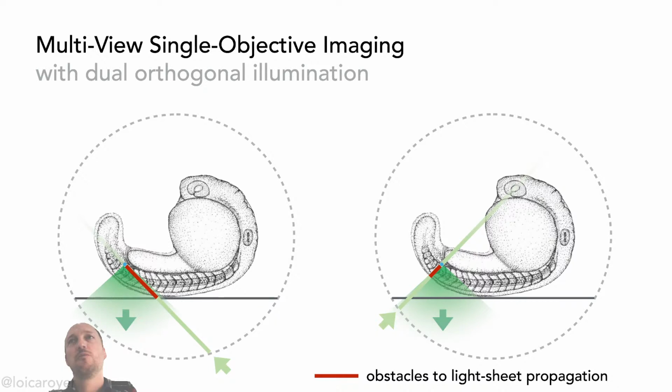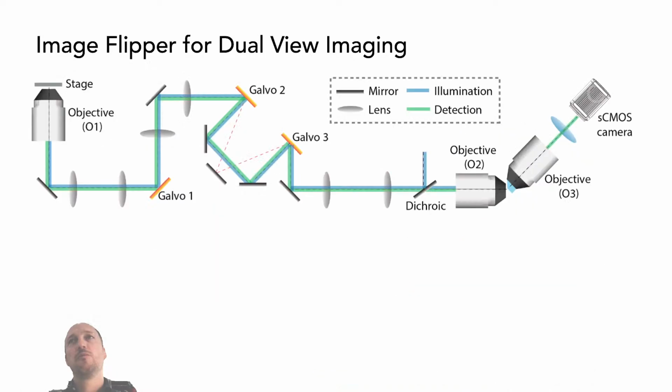So it's really about the difference in illumination. And we do see a very strong effect on image quality if we can combine information from both views together, right? In this case, for this blue point, clearly the information from the view on the right would be better. But it might be a different story in different parts of the sample. So we need to do something smart about combining the information. So how do we actually do that?